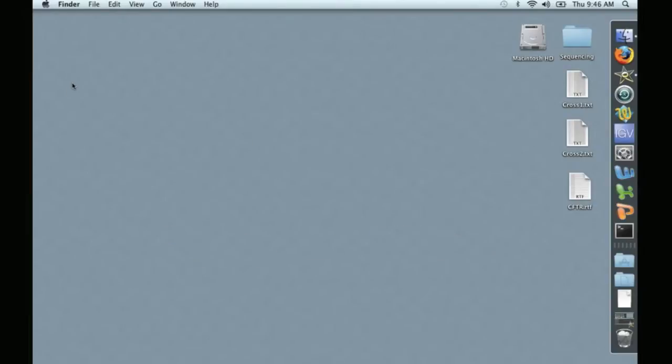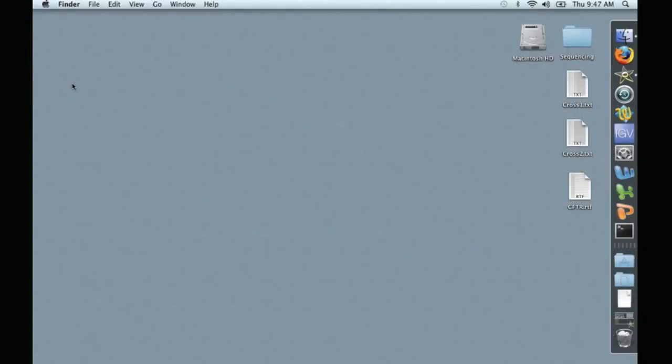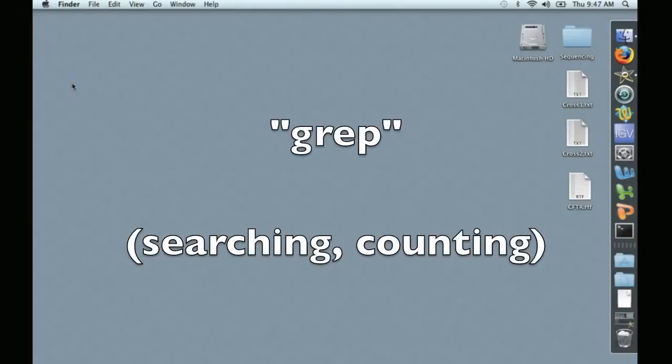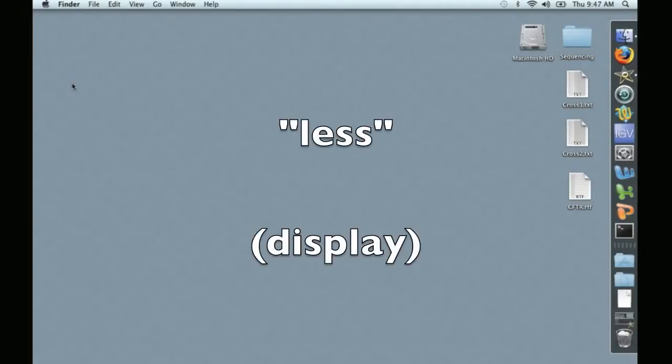Today we're going to learn how to analyze a large sequence file using a program called the Terminal. In particular, we're going to focus on two commands: Grep, which we'll use to search and count, and Less, which we'll use to display.